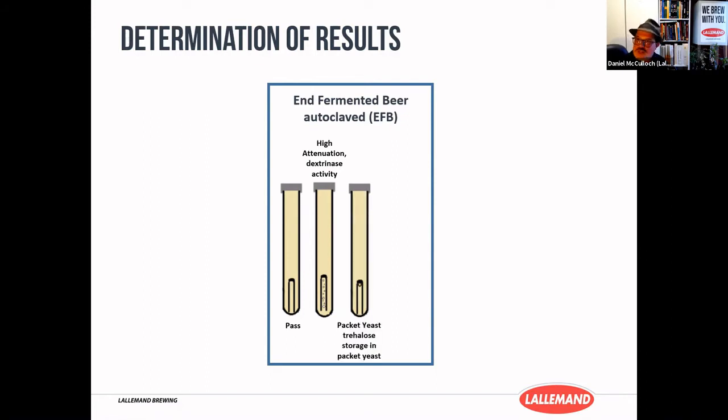Packet yeast, or you might still have a little bit of residual extract, and this is where you might want to pour that tube into another tube and incubate again. Or medium attenuation, so something like Belle Saison, where it's going to fill about half the tube and not all of the tube.